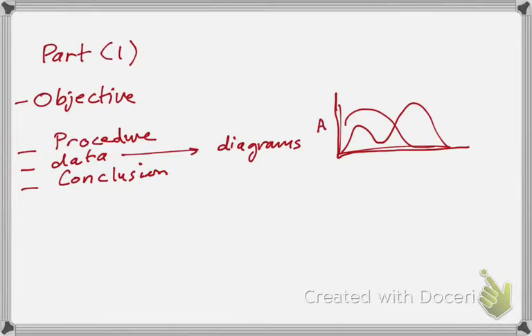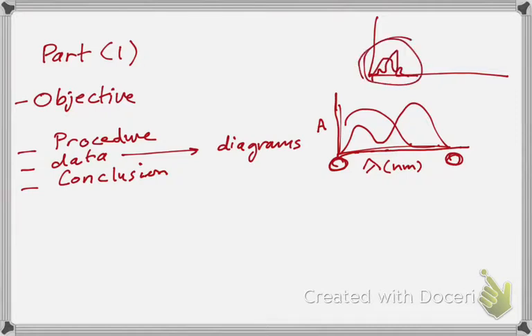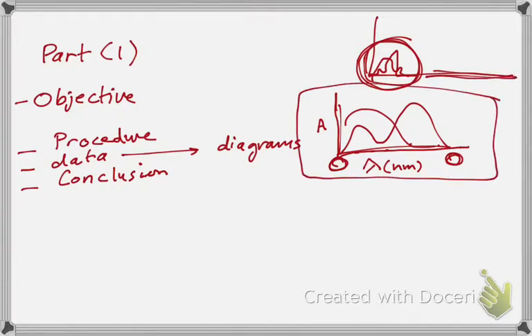The y-axis is absorption. This here is wavelength in nanometer. It would have to be graduated, starting from whatever wavelength the data start, ending where they ended, and make sure that the scale is appropriate, meaning avoid having something that looks like this, where you only draw at one small part of the axis and the rest of it is empty. It should be more something like this.